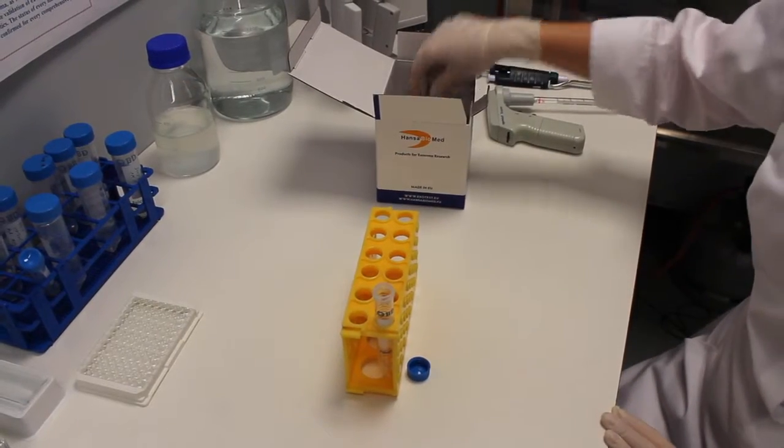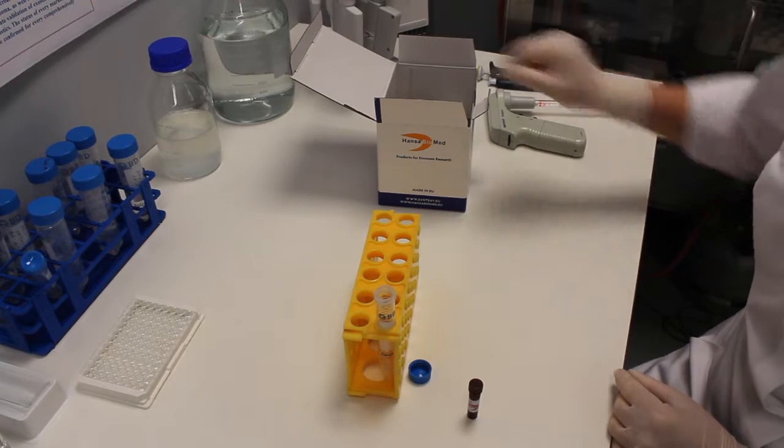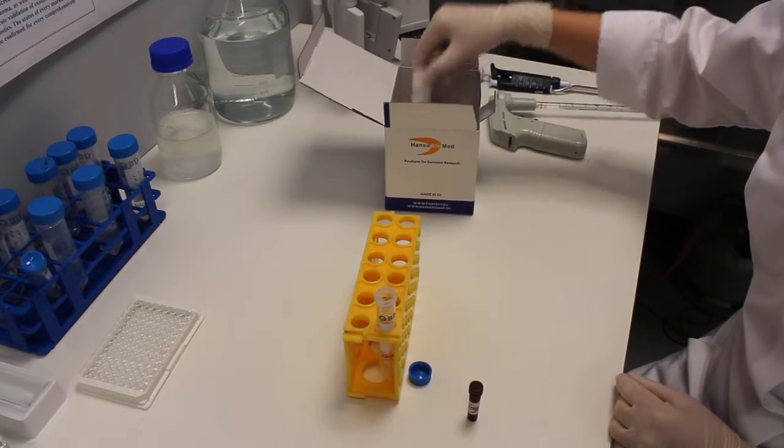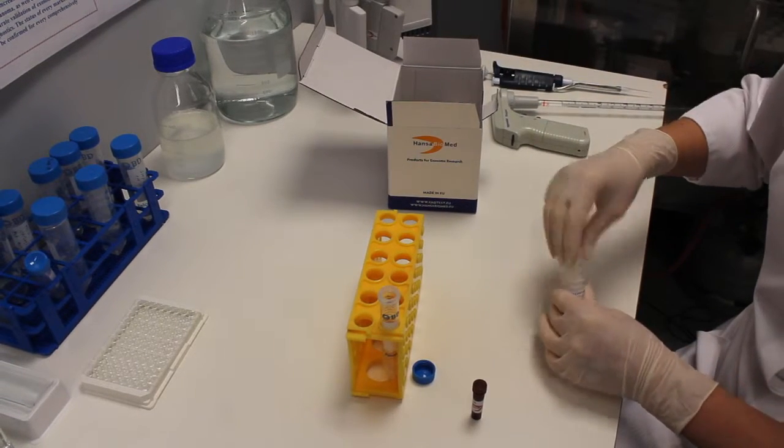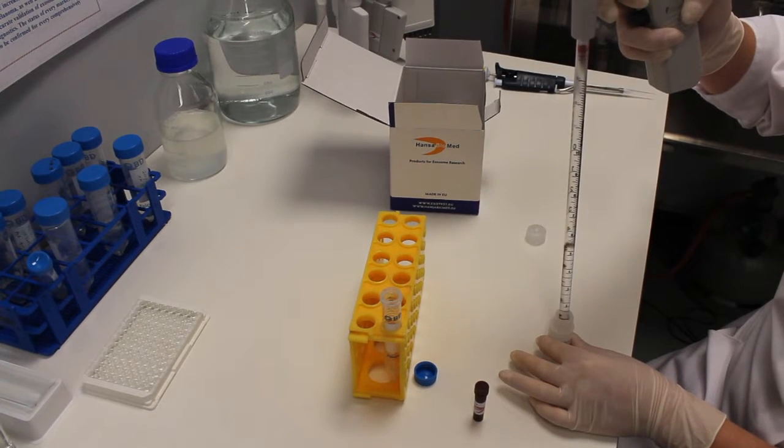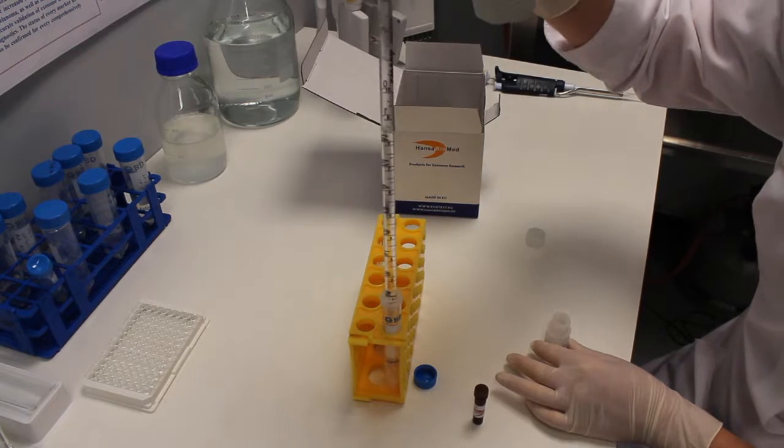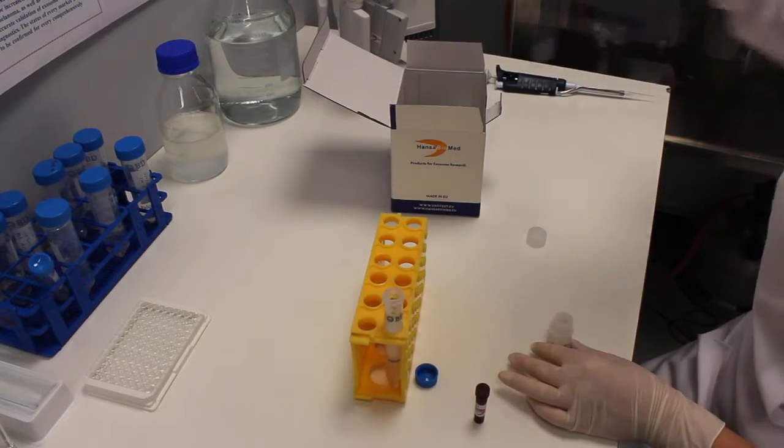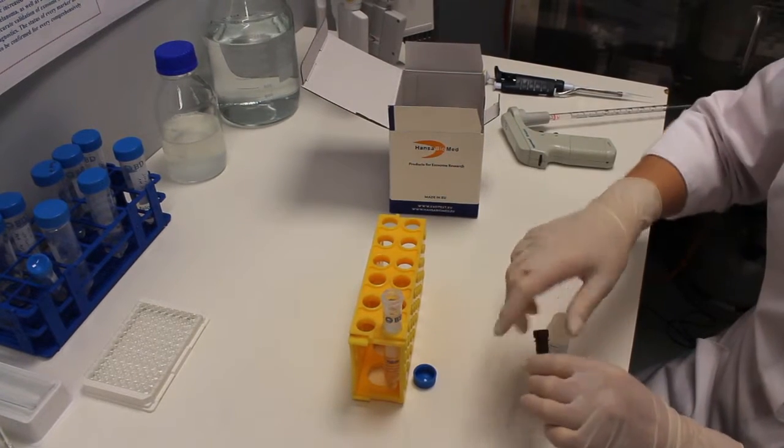Dilute secondary antibodies 2,000 times. To do this, we take 10 ml sample buffer and add 5 microliters of secondary antibodies.